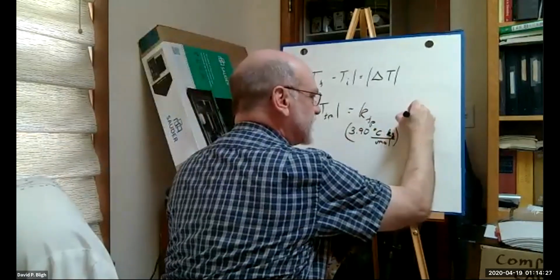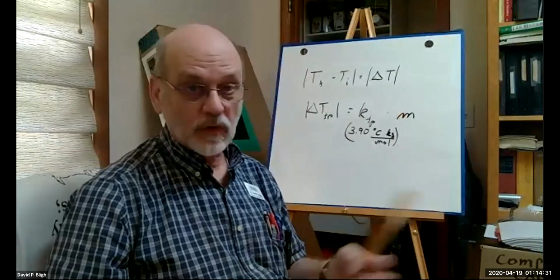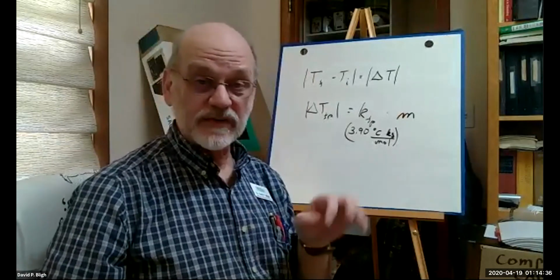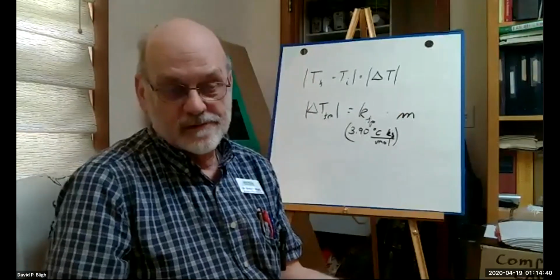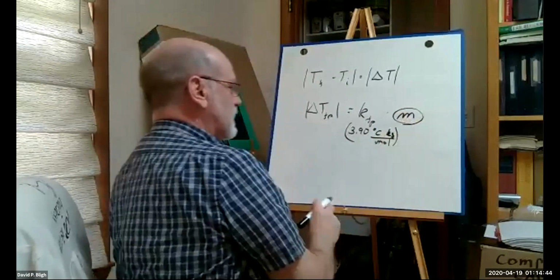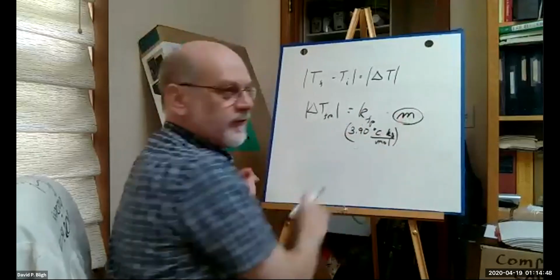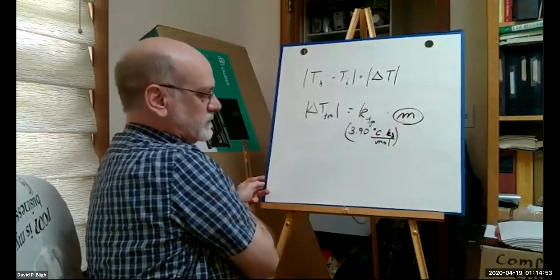And the molality is your unknown. You don't know what it is, right? Because you don't know how many moles of benzoic acid you actually put in that tube, right? So you can't calculate the molality. So we're going to solve for this one. So you get a value here, a constant here, solve for the M, right? So the M is this one divided by that one, right?